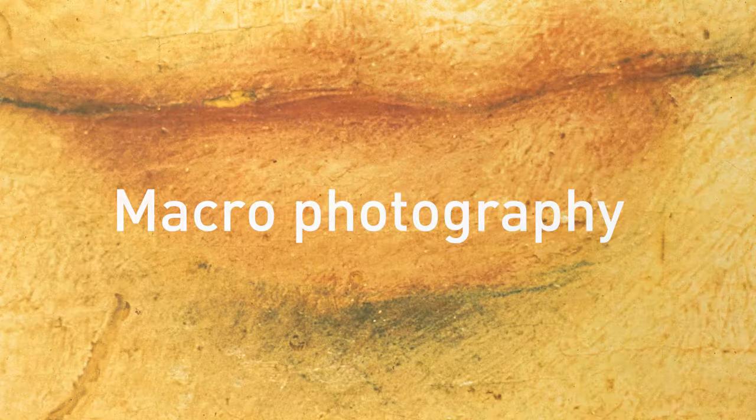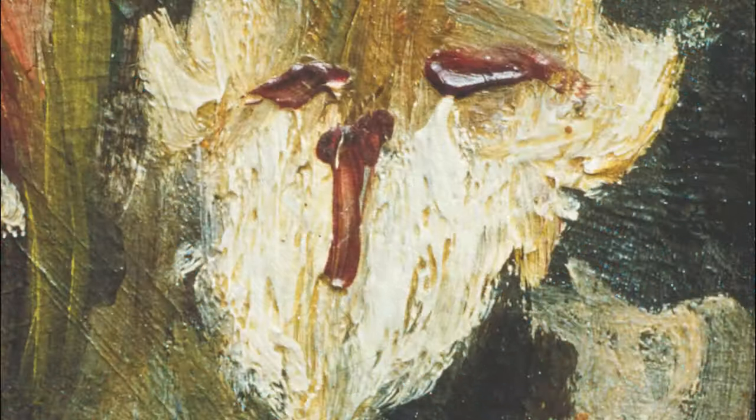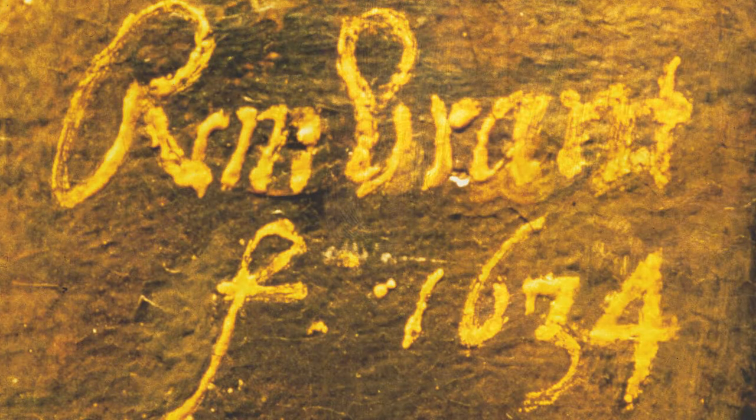Macrophotography is close-up photography of a detail magnified by the lens. It allows us to observe the painter's brushstroke by distinguishing between the impasto layers. It is a very precise reading to help us understand a painter's work and an invaluable basis for comparison when we examine a painting for the purposes of identification. Chemical analysis and microsampling of pigments.